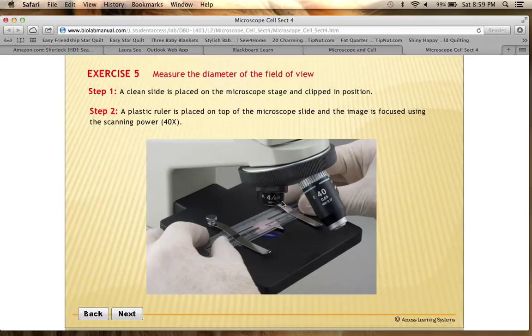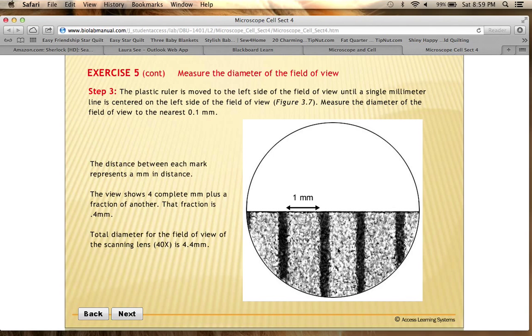Remember that the eyepieces up here have a 10x magnification, so when you multiply the 10x eyepiece by the 4x objective, that gives you a total magnification of 40x using the scanning power. So this is us looking through the microscope at the ruler, and we're looking at a 40x magnification.